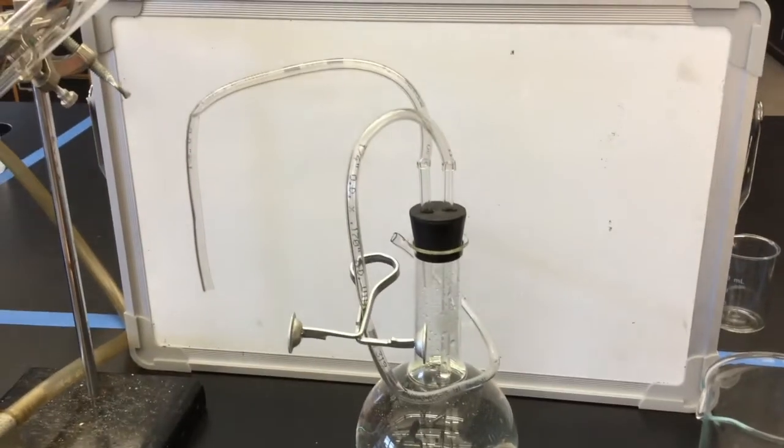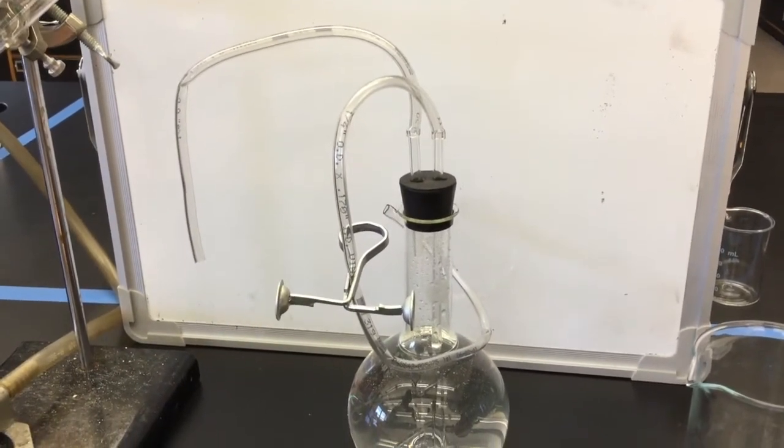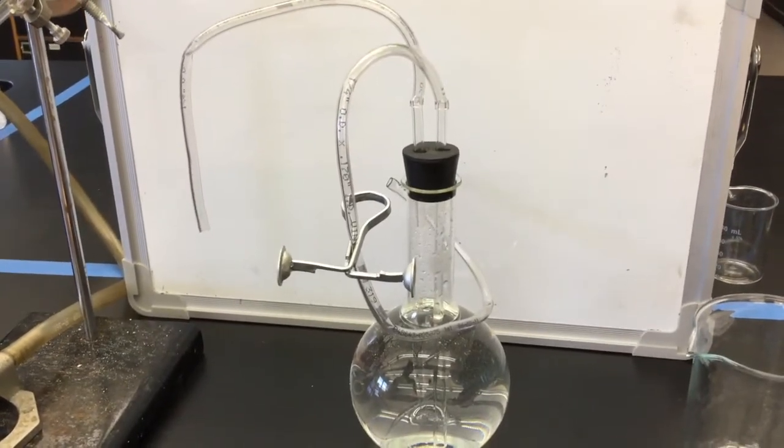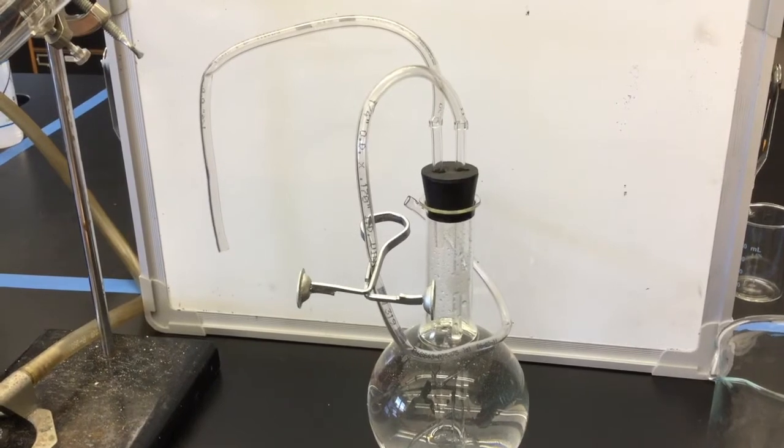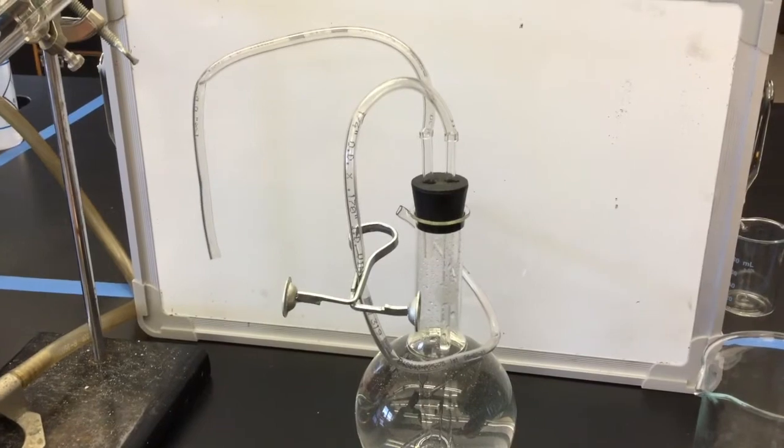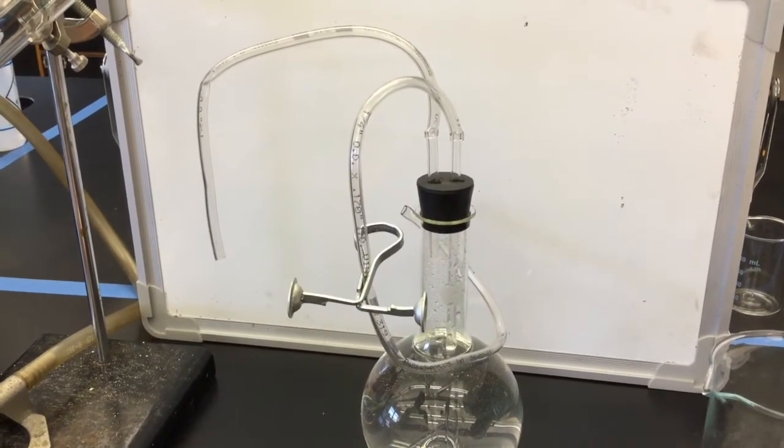Fill your Florence flask so that the water reaches the base of the neck. Then add the stopper with the two tubes. The tube that goes all the way to the bottom is for the water to leave the flask and has a pinch clamp attached to it. The other tube is for the gas from your reaction to enter the Florence flask. This is the gas intake tube.